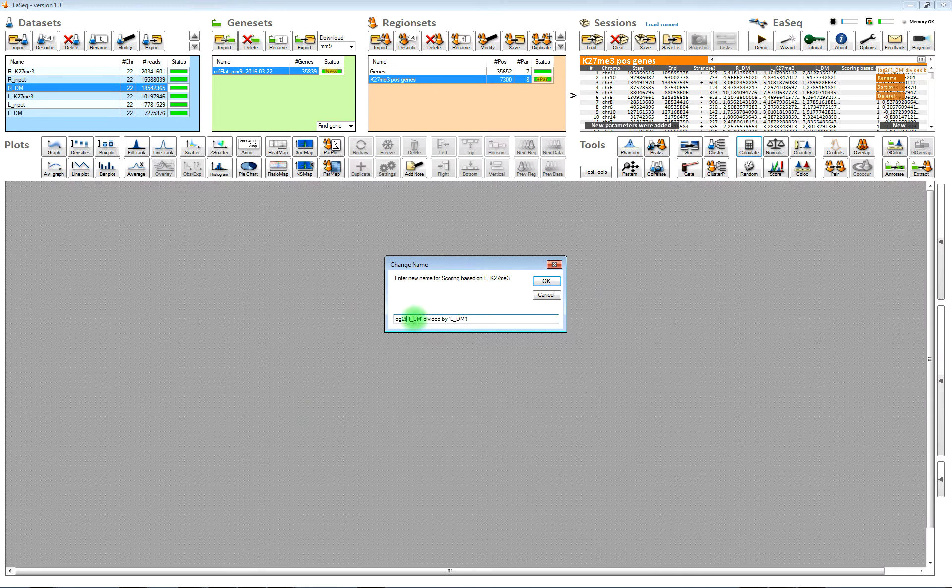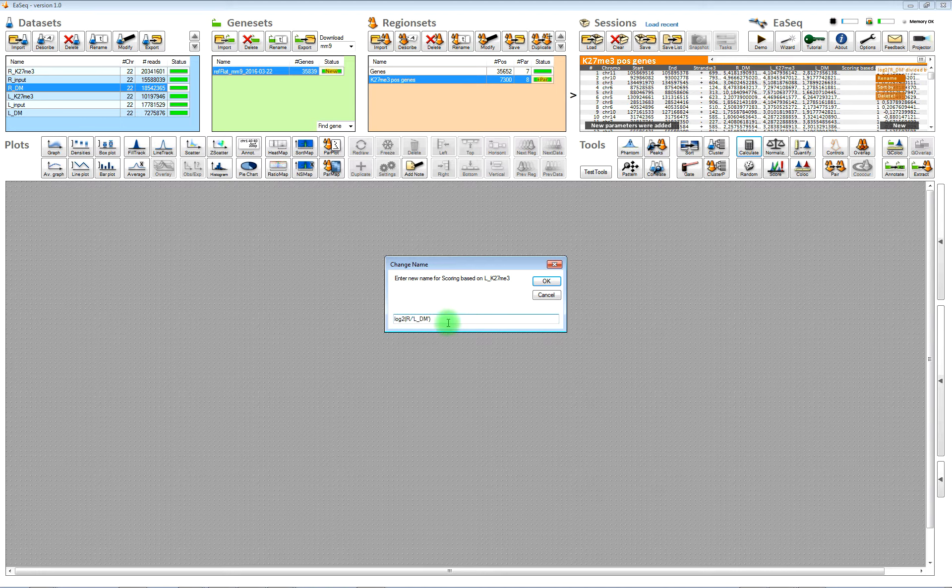The names are very long and it usually makes it a lot easier to find your way around if you choose some shorter names.